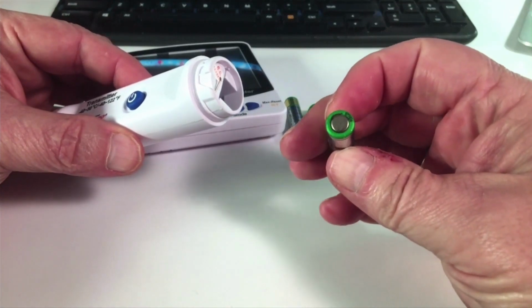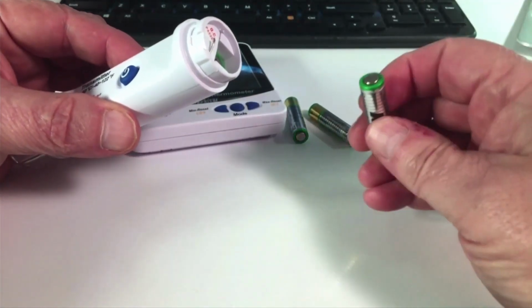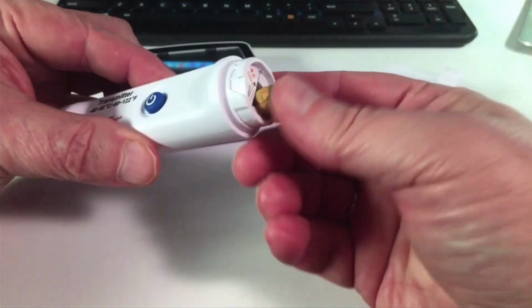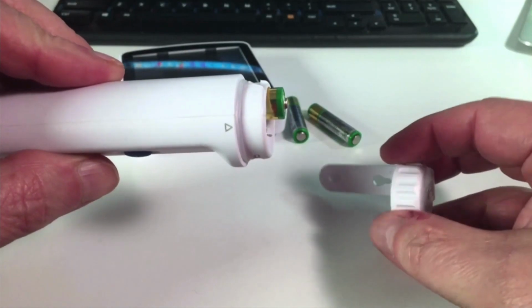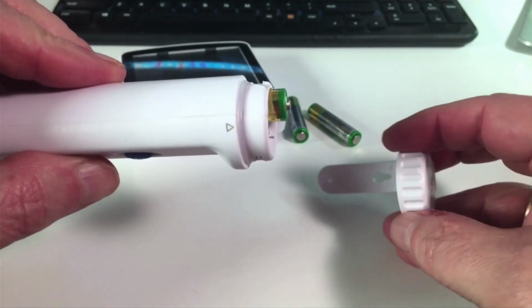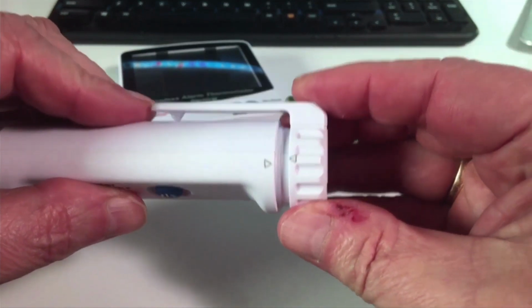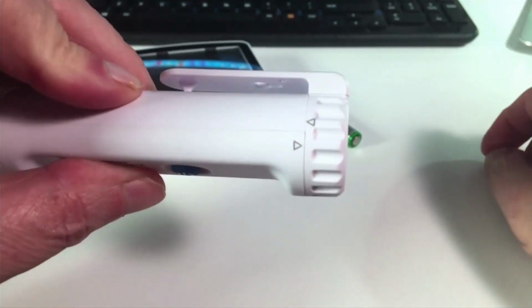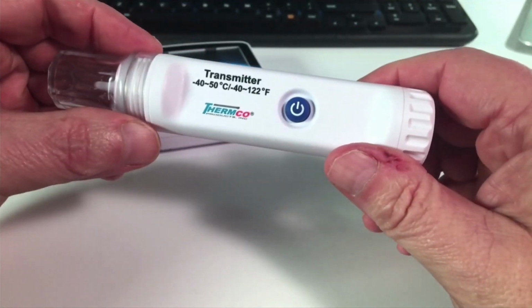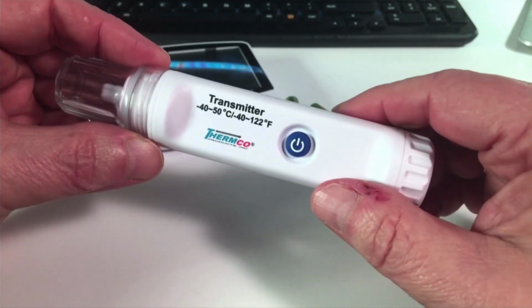The negative end of the battery goes in first. On the side you'll see a little arrow, and on the cap there's also an arrow, and all you need to do is line these up, push in, and then turn. About that much. All right, so now the transmitter is on and ready to be used.